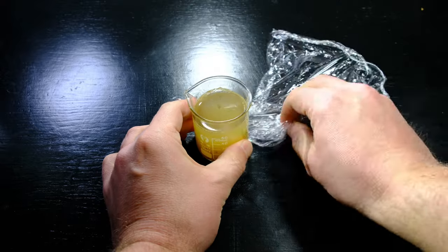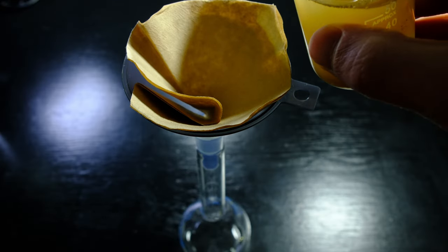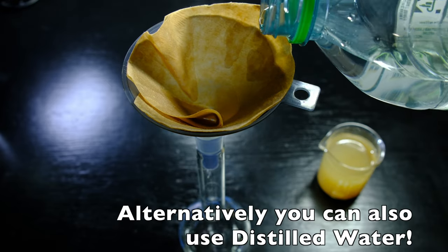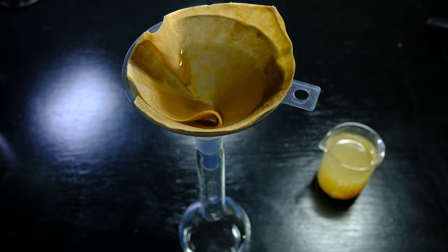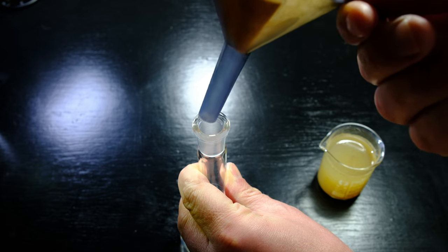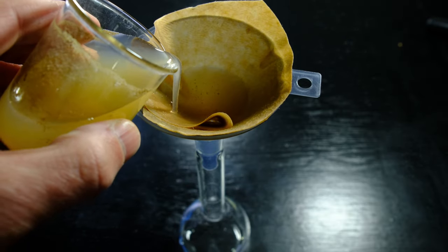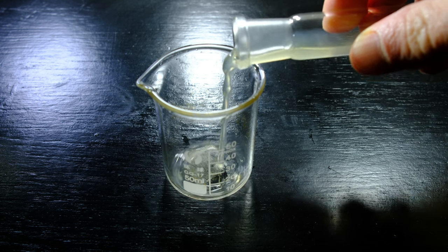After 3 days, we have to filter the soil extract. But before proceeding, we have to wash the filter paper a few times with mineral water. The mineral water that passed the filter paper and is now collected in the flask has to be discarded. After we went through this process, we can now filter the soil extract. The filtrate we obtain will still be murky, but that is okay. And it depends a little bit on the type of soil we used. Let's transfer the soil extract into a clean beaker.